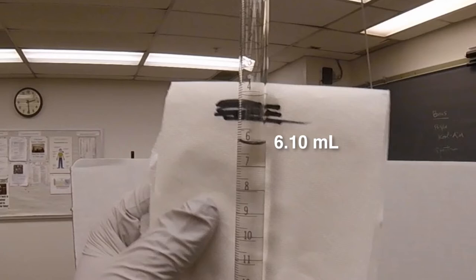Looking at the bottom of the meniscus, you have to approximate to two decimal places for the volumetric buret.